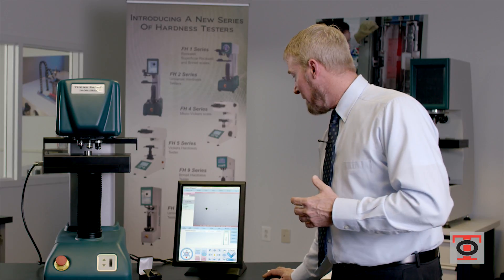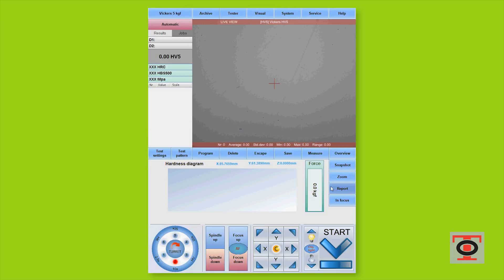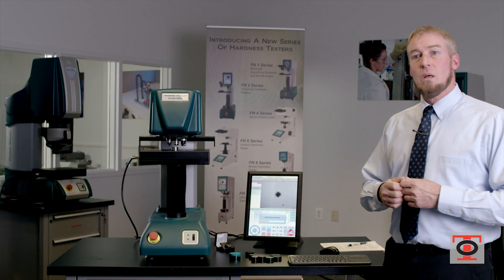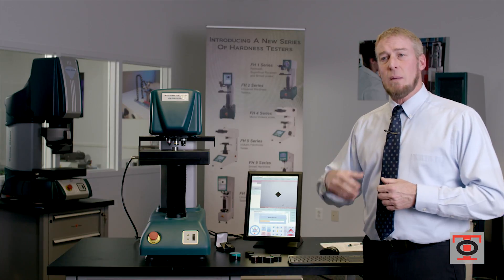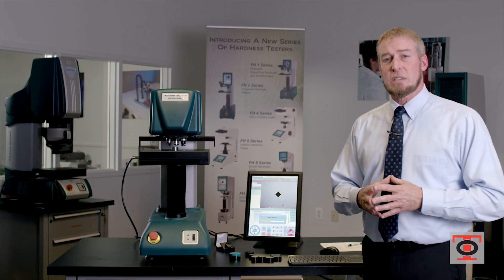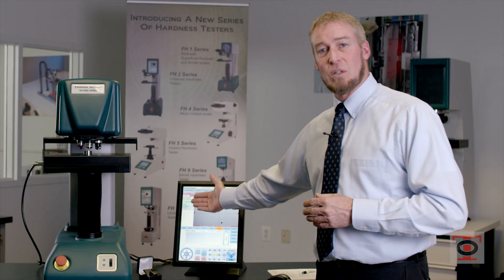I make sure my area is clear, so I'm going to move over to a clear area. I set my dwell time to 10 seconds and press start. Once it's done performing the dwell time, it goes back to the objective I selected. The indentation will appear in the center of your screen — and the most important part of the puzzle: the result.